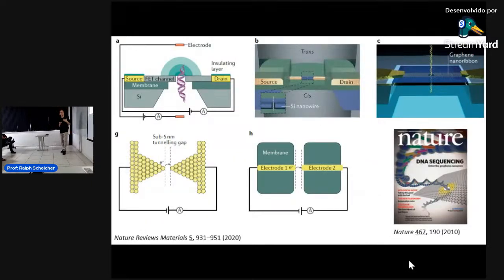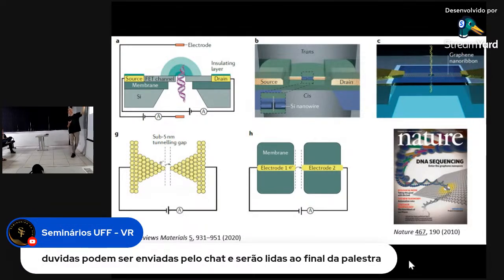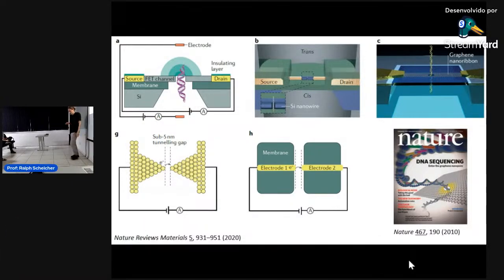And there are different kinds of detection mechanisms. I was just talking about before that you can use the ionic current. And this is, of course, always possible. If you have a nanopore and something is moving through the pore, you can always detect the ionic current. But you can also have an electrical circuit, with an additional voltage source that is probing the entity going through the nanopore through an electrical current. And there are different ways to do it.